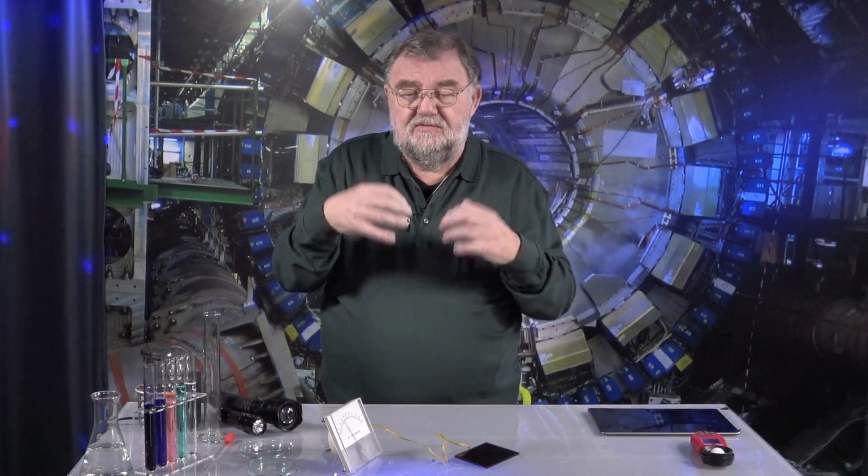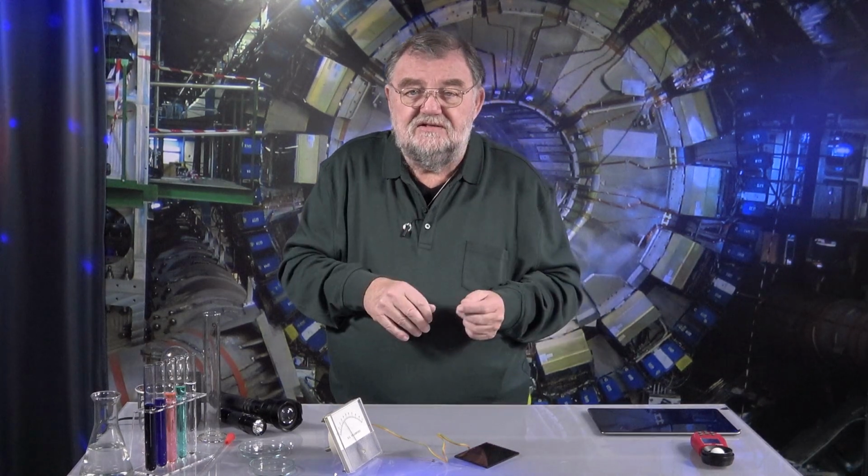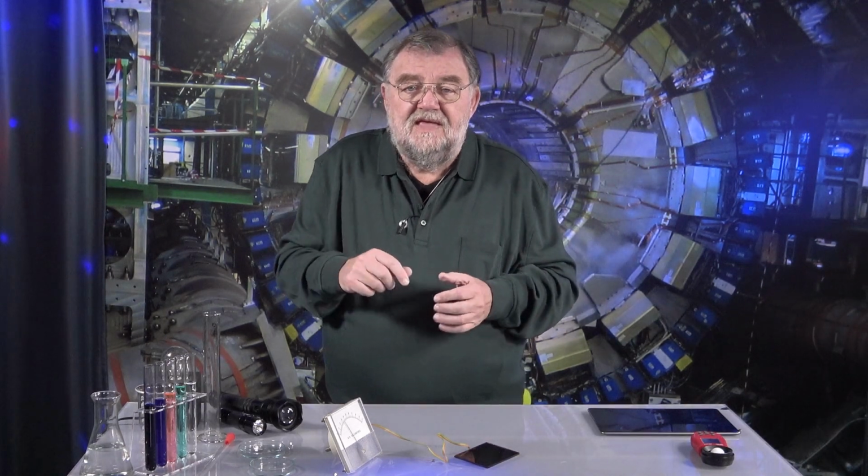We can put a certain chemical into this fluid and then determine what ingredients are in it, because the chemicals we have put in are known, and they react with the ingredients and then change the cloudiness. And this cloudiness is a bit difficult. It is measured in NTU. I don't want to say more, I would probably say it wrong anyway, but this NTU unit is held in guidelines, and they are identical to the FTU units, just with different values. This is necessary for people who are trusted with these themes, who have to assess and qualify.